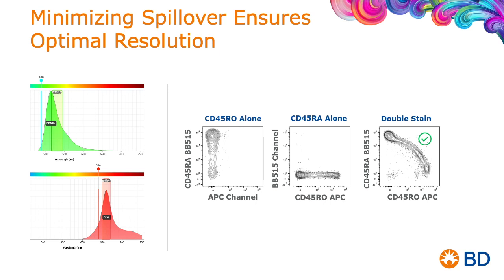So these are two very quick examples of why understanding spillover and spread has an impact ultimately in biology. And while it would be easy now to remember that we have learned that between APC and APC-H7 there might be spillover and not between APC and BB515, one of the major challenges now is how can we keep track of all the combinations of fluorochromes and what fluorochromes work well with each other in a complicated and ever-growing landscape of fluorochromes.